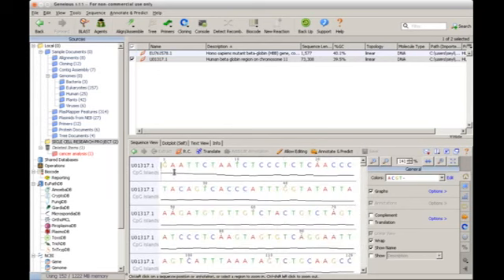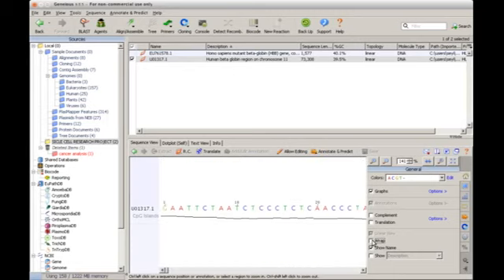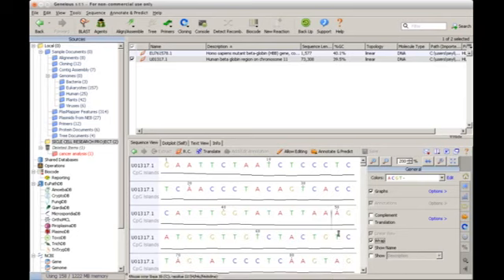These are the sequences starting from number 1. It is in a wrap form, so you can unwrap it. You can zoom it so that you understand what you have, and you can wrap it again so that you're able to have full sequence view.